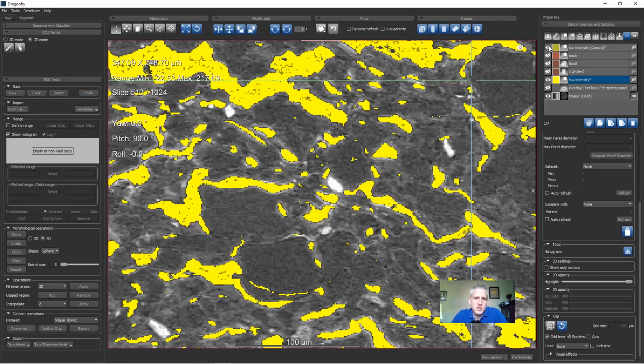So you can see where it got closed in. That's a pretty good job. So I like the closing operation. So this is the one I've smoothed. This is the one that hasn't been closed. So I should relabel that. So this one is closed.